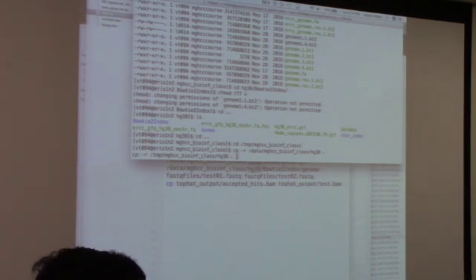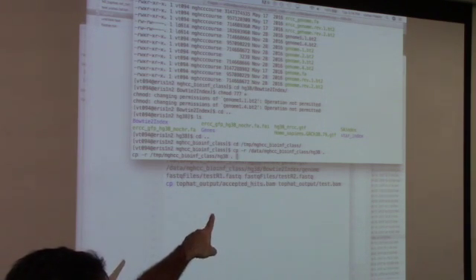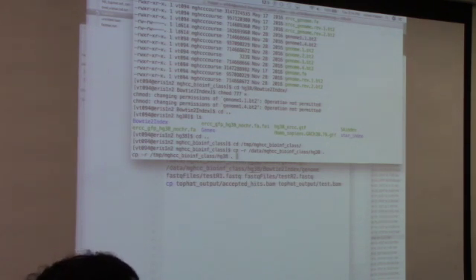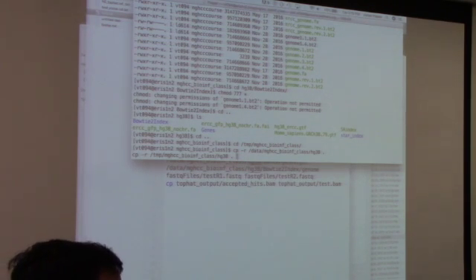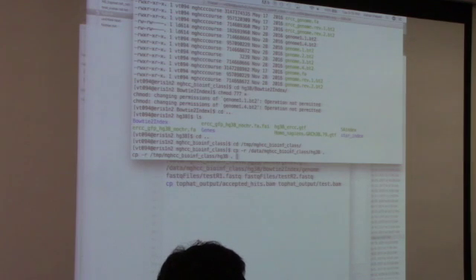Nobody presses enter yet, because it's still copying from my end. Do not press enter. Wait for it to finish. When it finishes here, then all of you can copy at once. Alright? Get it? Okay, so not yet. Hold on. Did it finish? No, it hasn't finished yet.